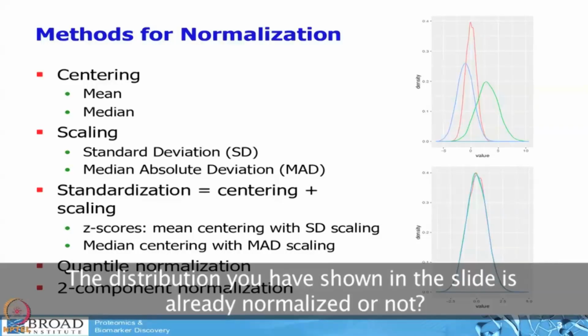Scaling is not the same. You see those now. Which scaling is not the same? The upper one, and you have the 3 peaks. Yeah. And you now did the centering and the scaling. So the upper one is unnormalized data. After you do centering and scaling, you get what is in the bottom. And you are saying the bottom is not lining up? Well, it may not be exact.